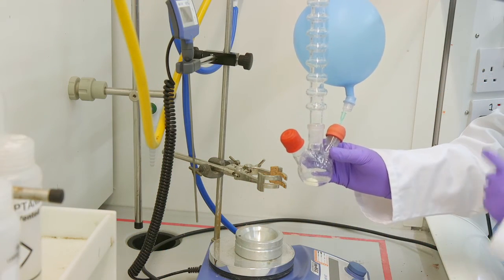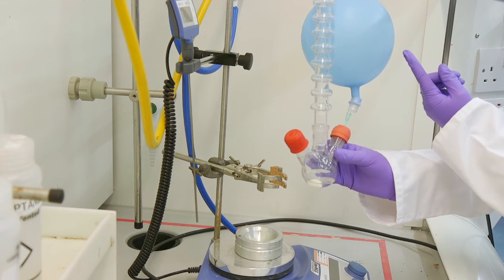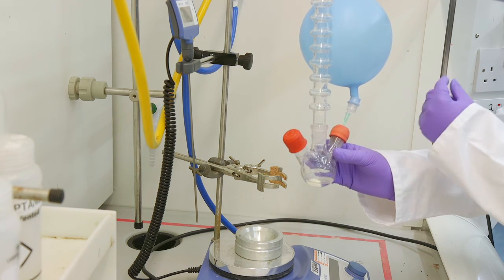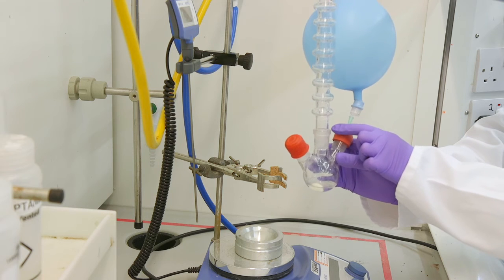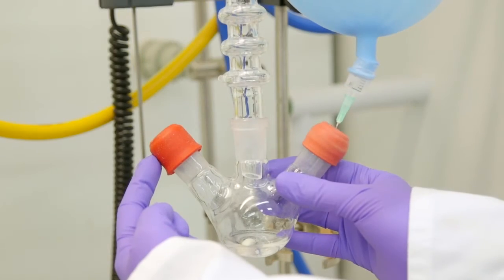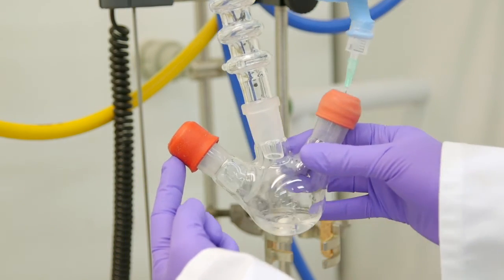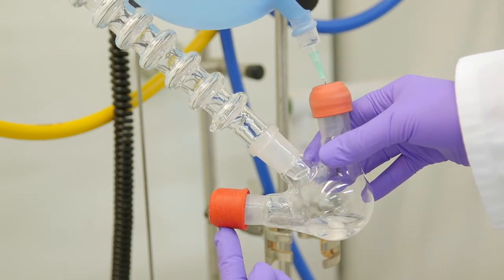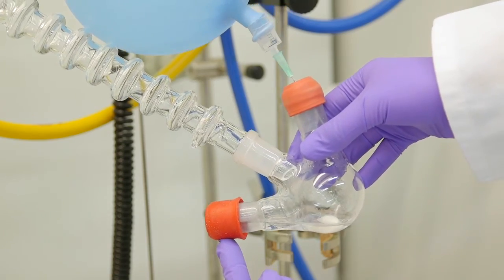We want to keep everything under nitrogen as the Grignard is air sensitive. The best way to do this is to use a double-ended filter funnel. We can connect nitrogen to the top and then connect both funnels and tilt the reaction. This will separate the magnesium turnings from our Grignard in solution.